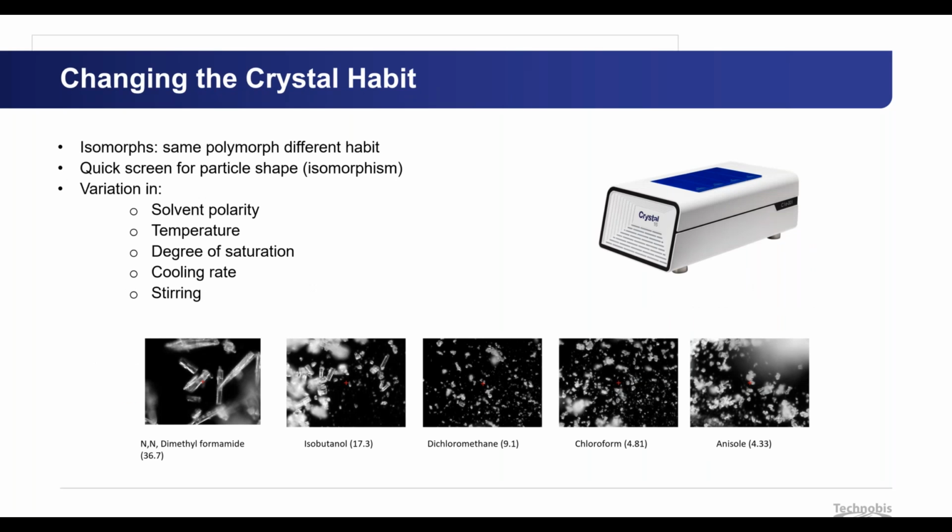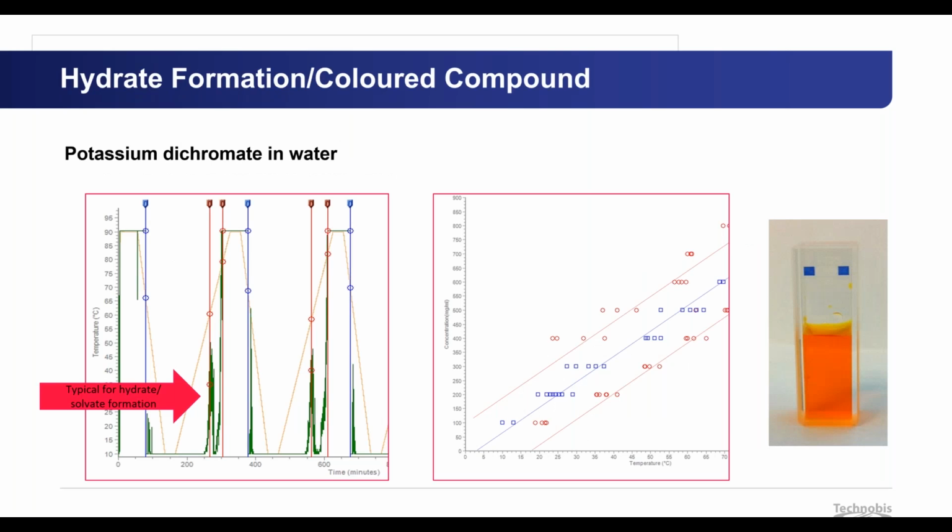Another one in terms of changing crystal habit, this was part of a study where we were looking at solvents, different solvents with different polarity, and how they would influence the shape and size of the crystals that you can make. I think here the images are quite self-explaining for this. I'll go even faster now into this.